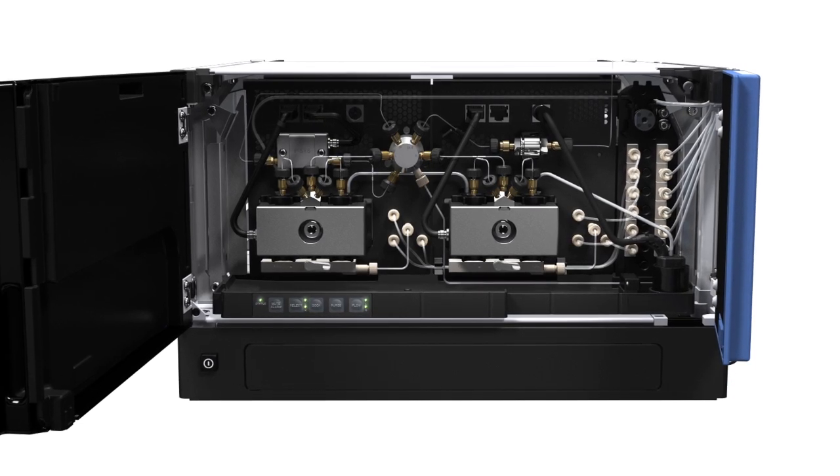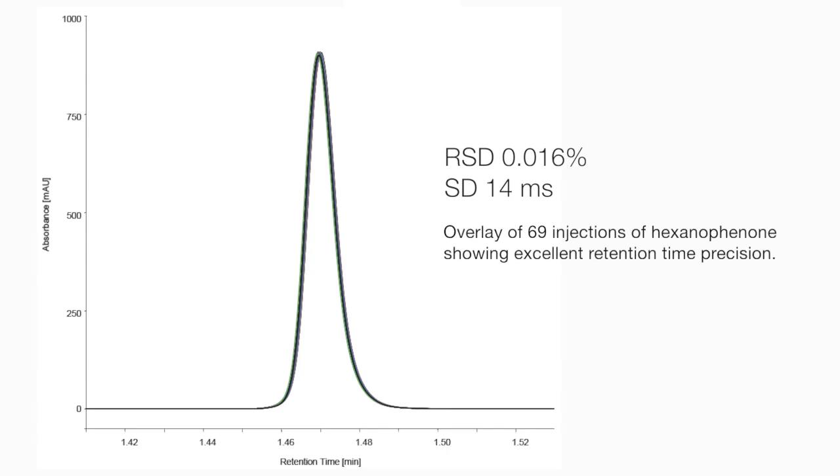From ultra-fast to extremely shallow gradients, the Vanquish UHPLC system always provides unmatched retention time reproducibility and the lowest baseline noise.